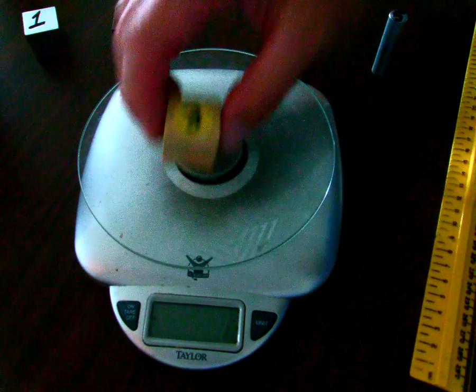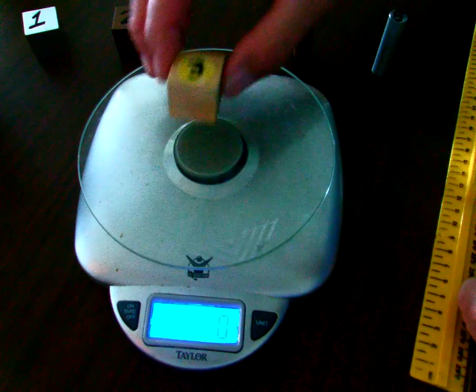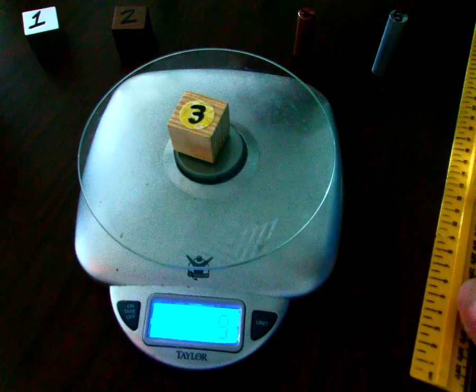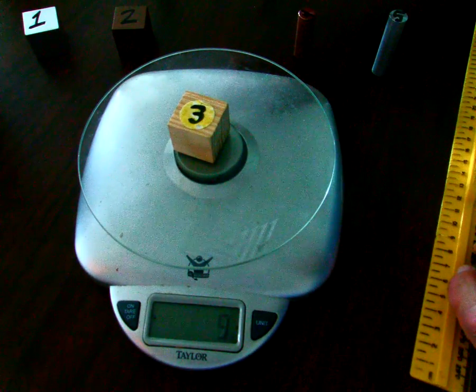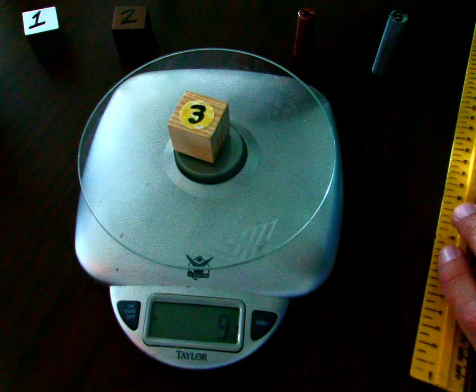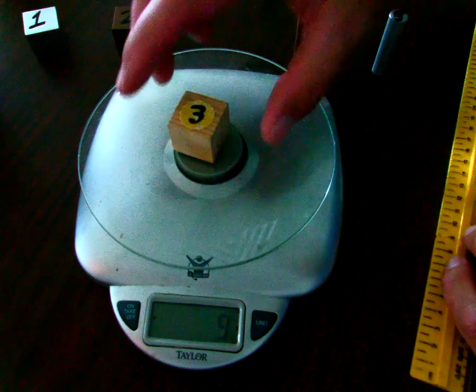Let's go ahead and mass block number 3. Block number 3 comes in at 9 grams. Go ahead and record that information into your data chart. So now you have the mass for block 3. You also have the volume for block 3. Take a second to calculate its density.